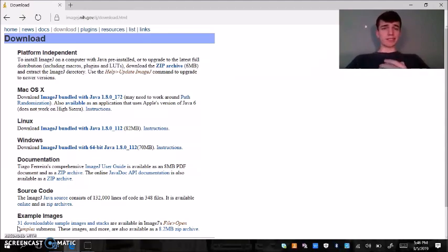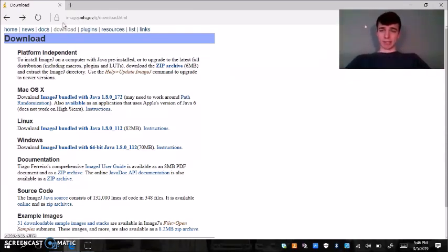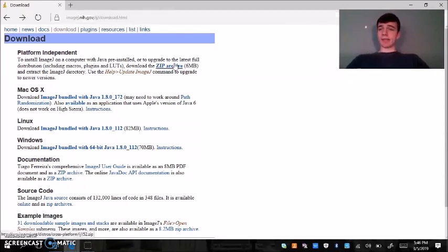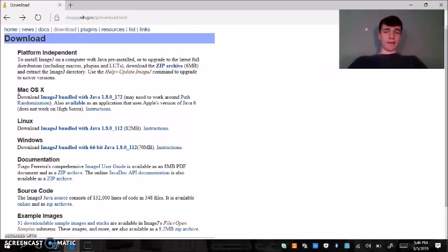The first thing you want to do if you haven't done so already is to go to this site, it's imagej.nih.gov/ij/download and depending on what kind of computer you're working with you're going to download either the Mac OS file or the Windows ImageJ file.